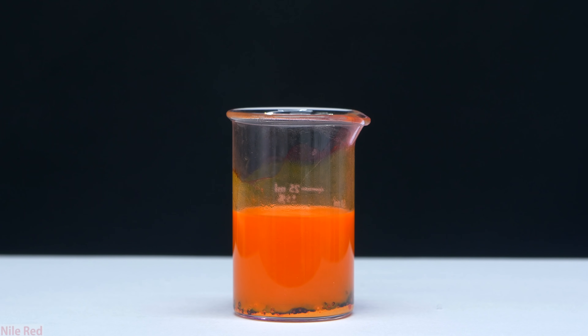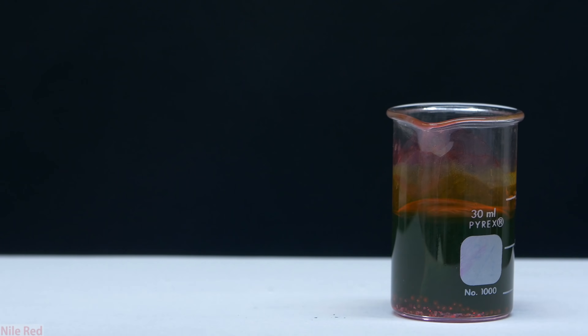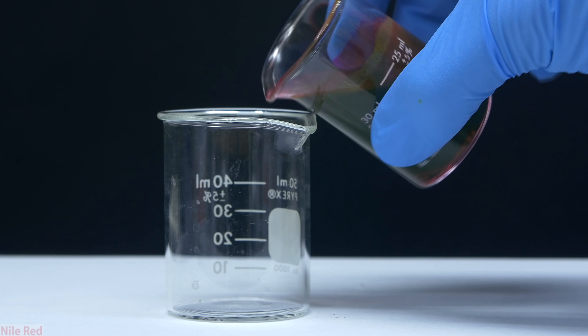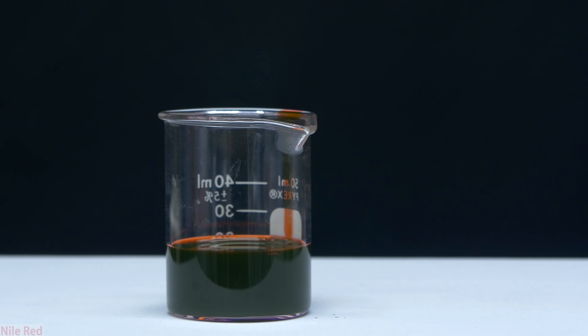The solution slowly loses its orange color and gradually takes on a slightly greenish color. In reality, the solution is actually dark orangish-pink, but the fluorescence of the eosin gives it this green appearance. There's a bunch of excess undissolved sodium hydroxide at the bottom, so I just decant our stock eosin solution into another beaker.